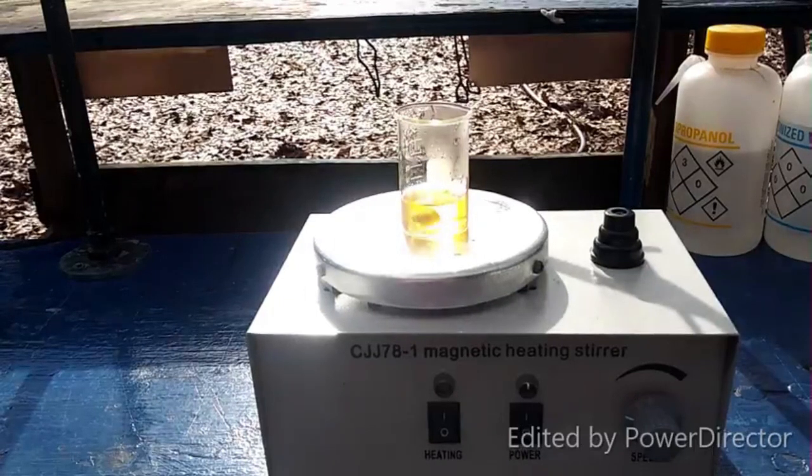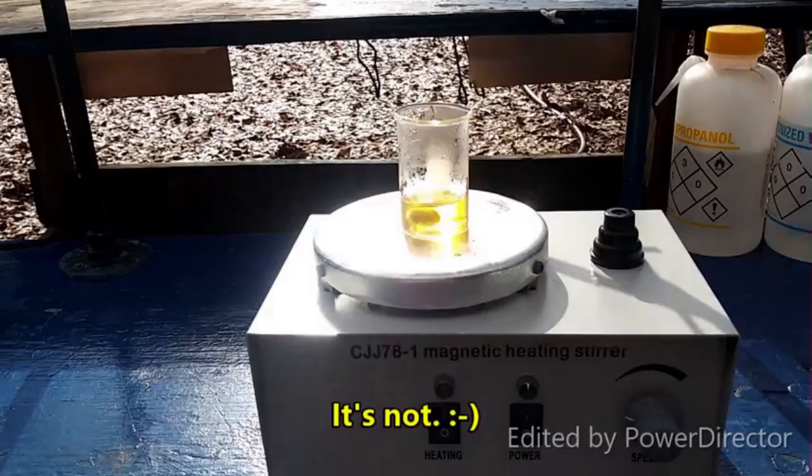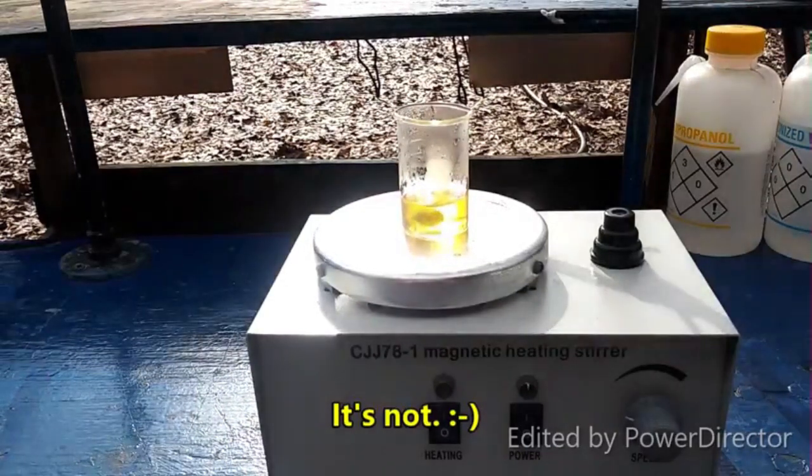I'm going to just let this evaporate down just like I did for the other one and see what I get. Fingers crossed that we get a distinctly colored solid. If it wasn't the same butterish yellow color, that would be great. But we'll see what we get.